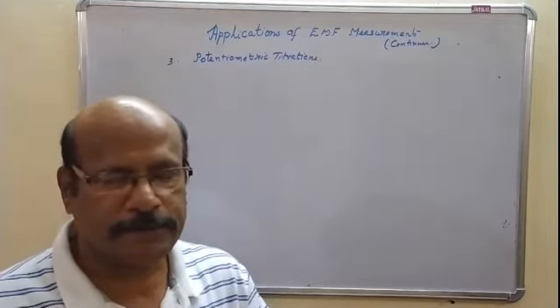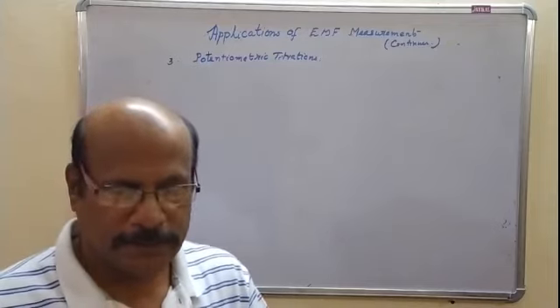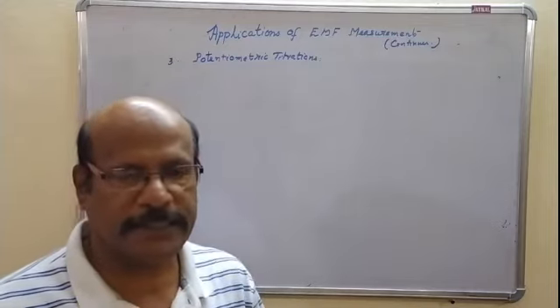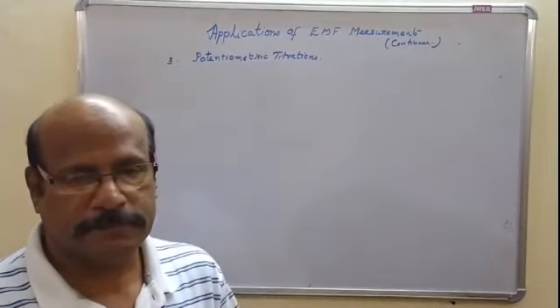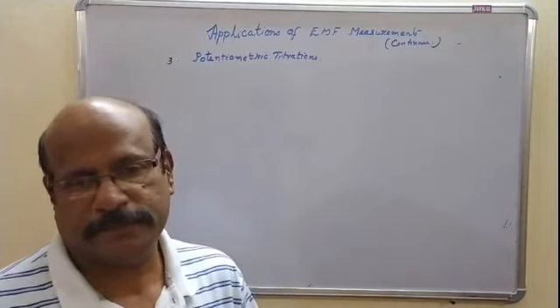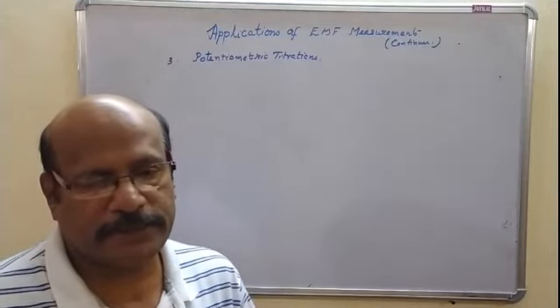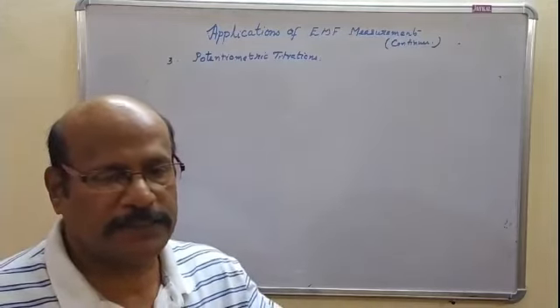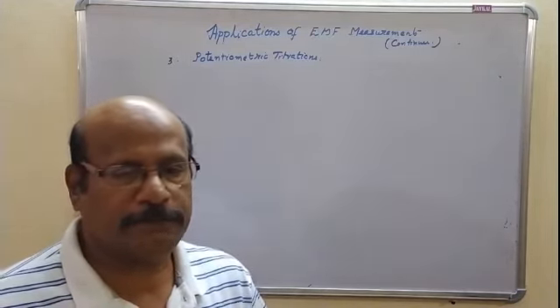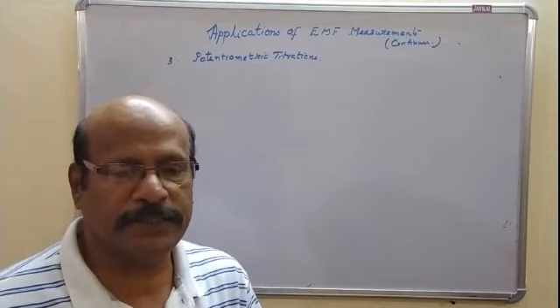As the titrant is added in small portions into the solution in the cell or beaker containing the indicator electrode, there occurs a change in the potential as shown by the indicator electrode due to the change in the concentration of the ion. And this potential is monitored. The change in potential is noted with respect to the volume of the titrant added. Then a graph is plotted between the change in potential versus the volume of the titrant added.